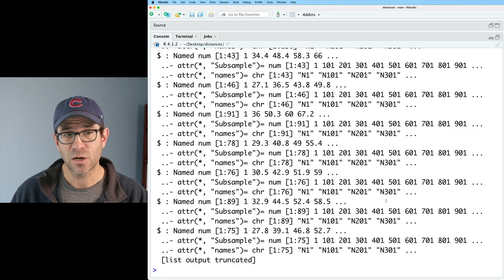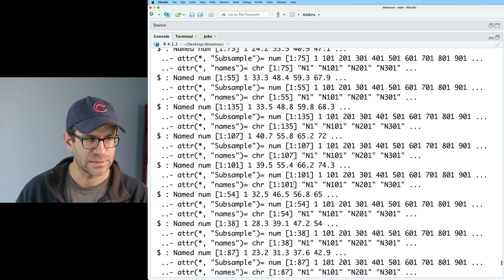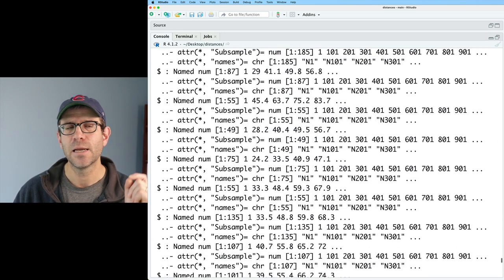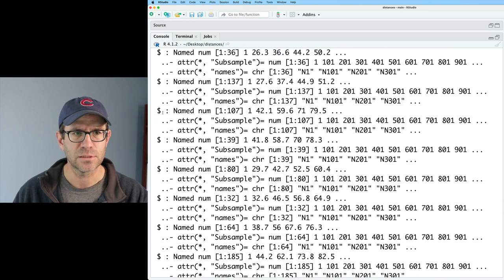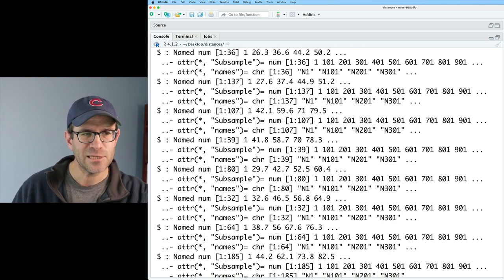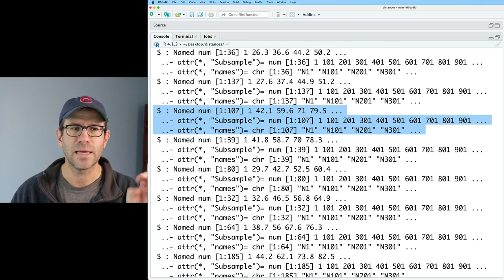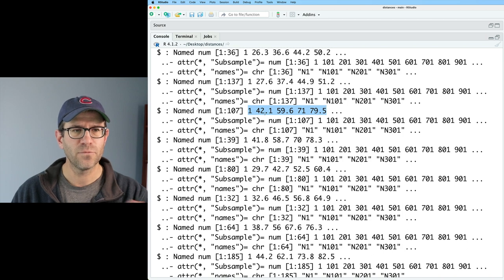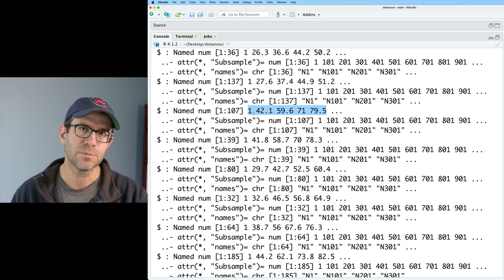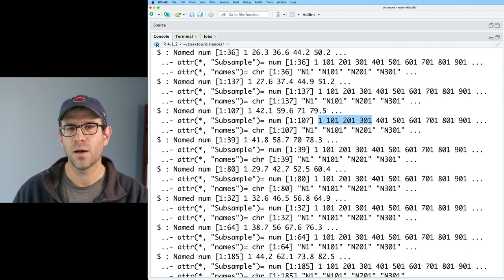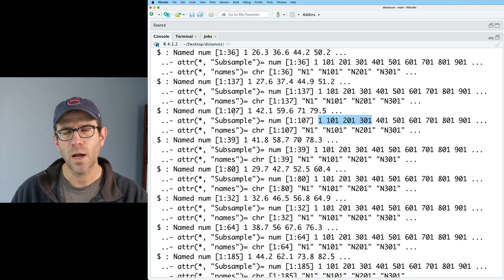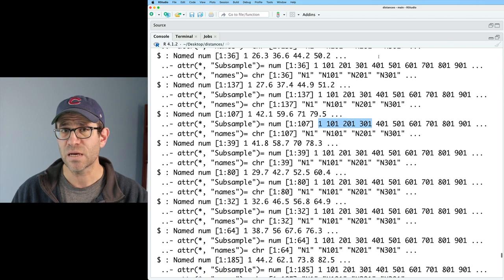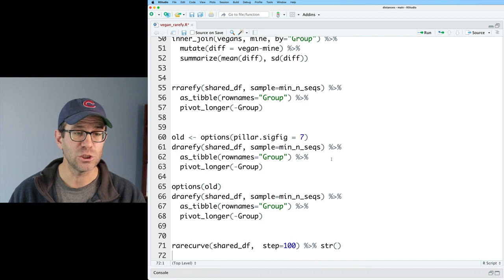So the str function reveals that the output of rarecurve is that figure, but it's also a list. And I know it's a list because I've got that dollar sign, but it's not keeping the name of each of the samples next to that dollar sign. And so that's a bit annoying. But the other thing that's interesting is that each element in this list is a named vector. And so we can see here, say, 142.1, 59.6, and so forth, are the number of expected OTUs or taxa that we would see for sampling 101, 201, 301, and so forth, right?